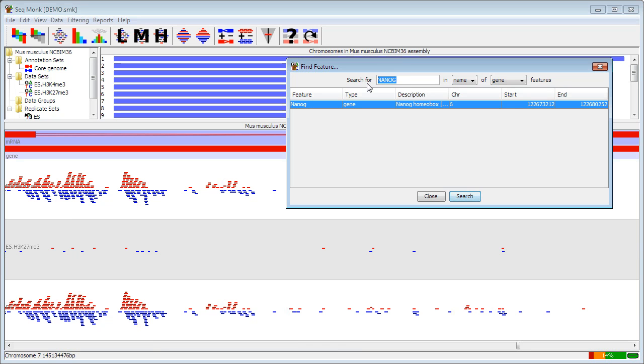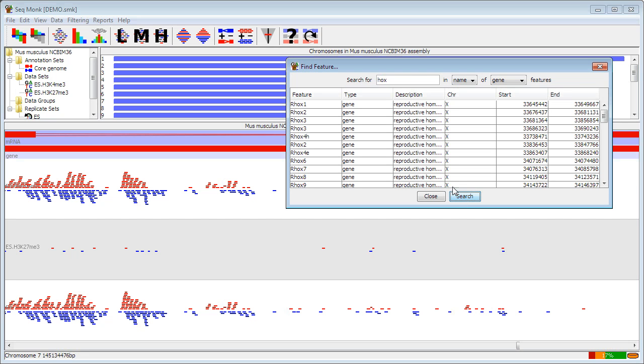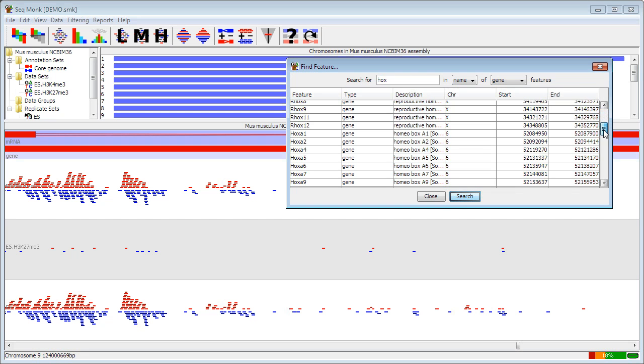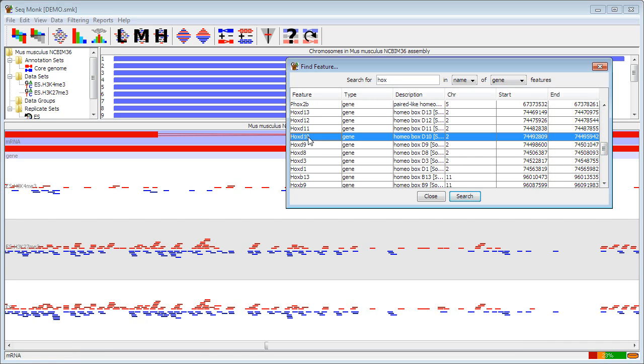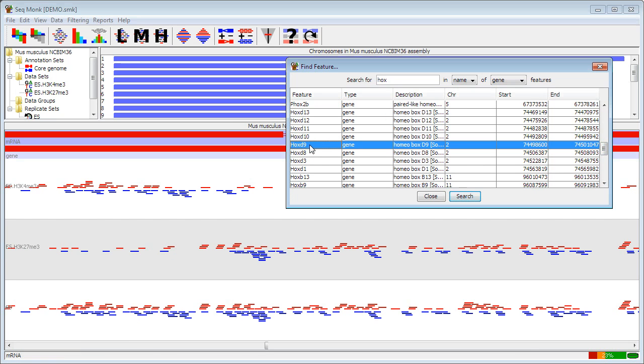If you put in partial gene names that's also fine. So if I search for hox for instance, I should get a big list of gene names which contain hox. And by double clicking on these I can review the different matches that I've got.